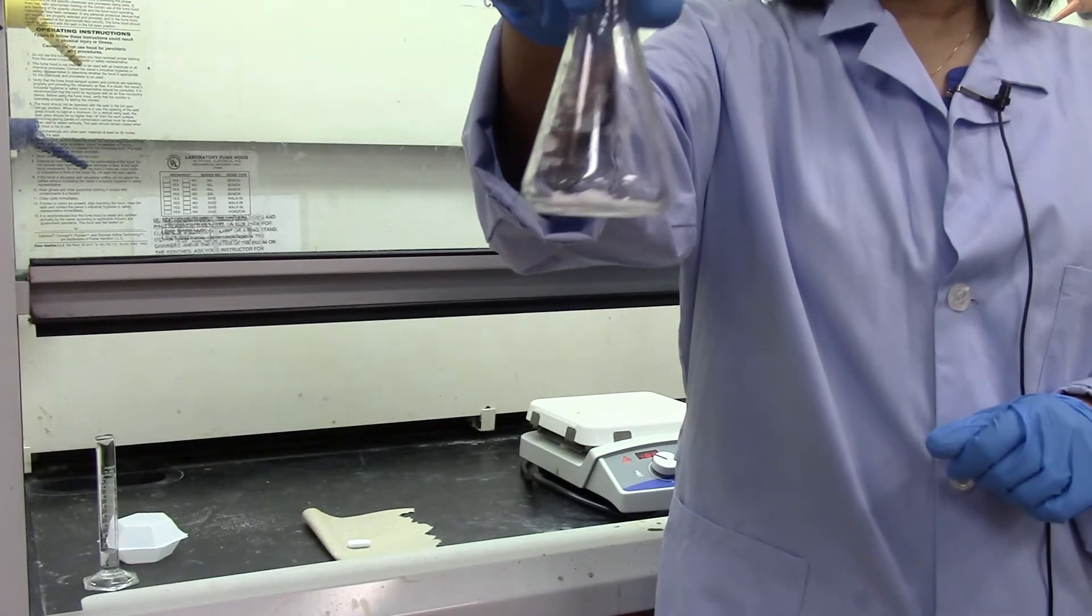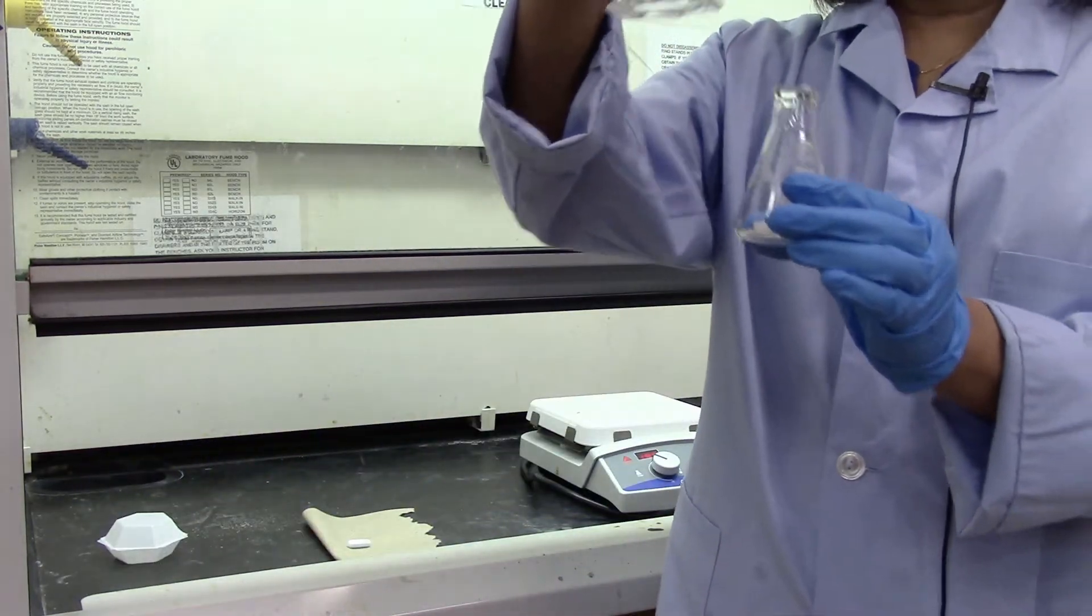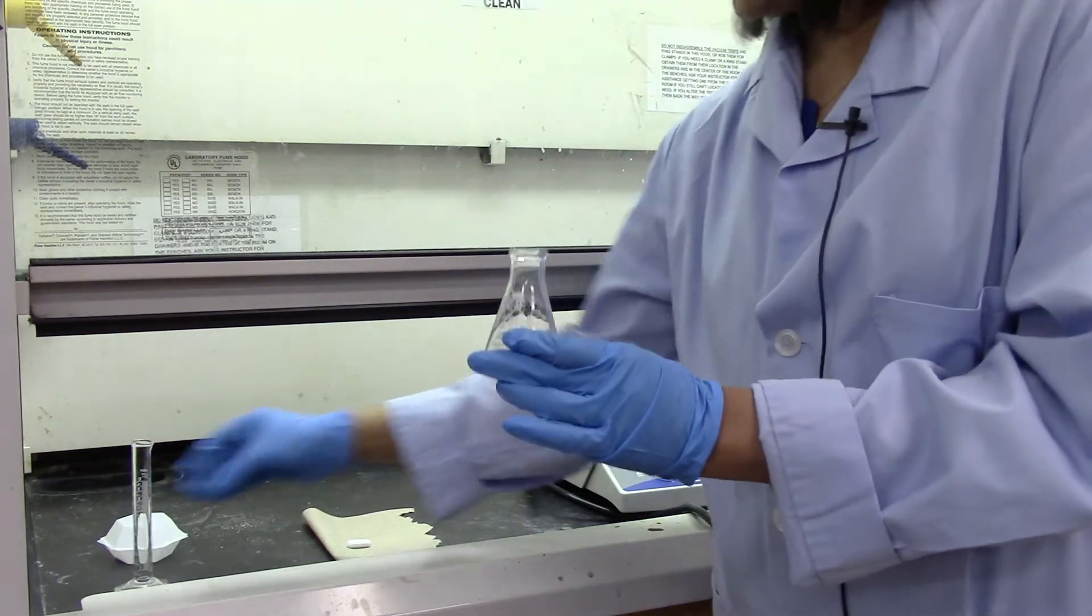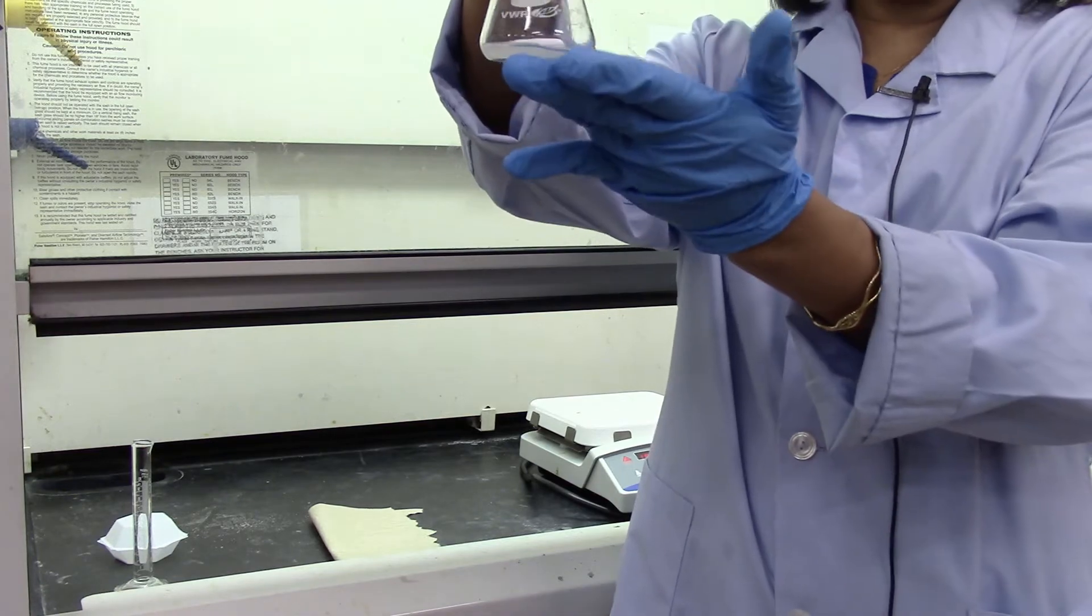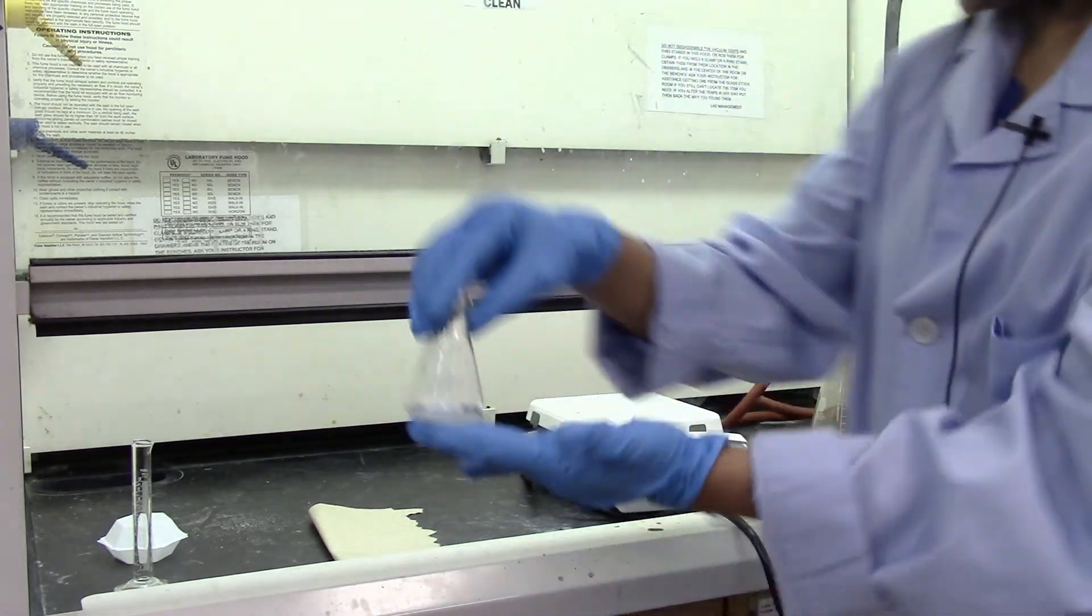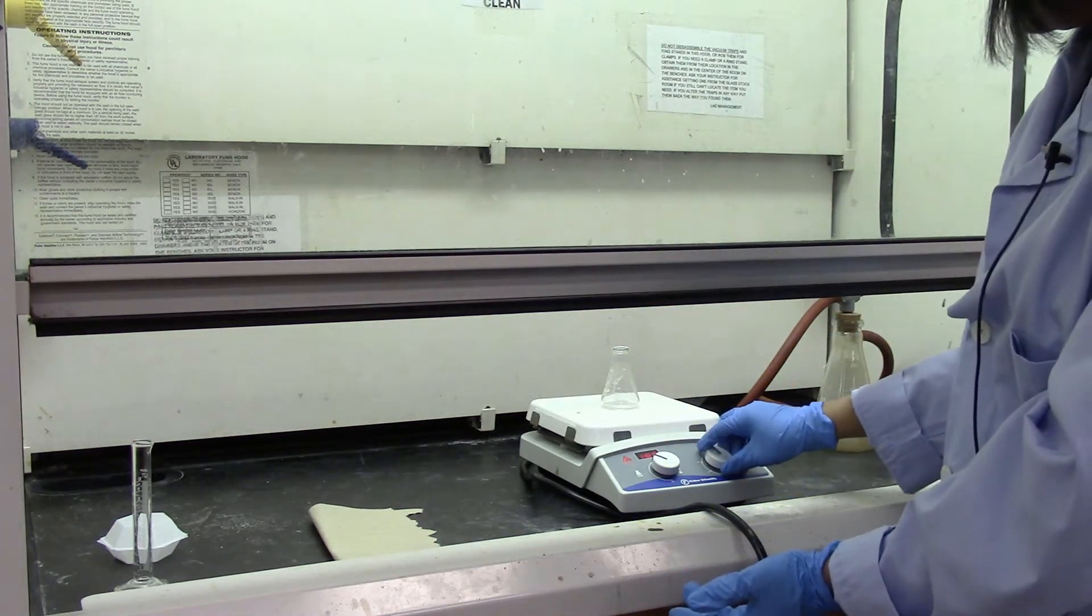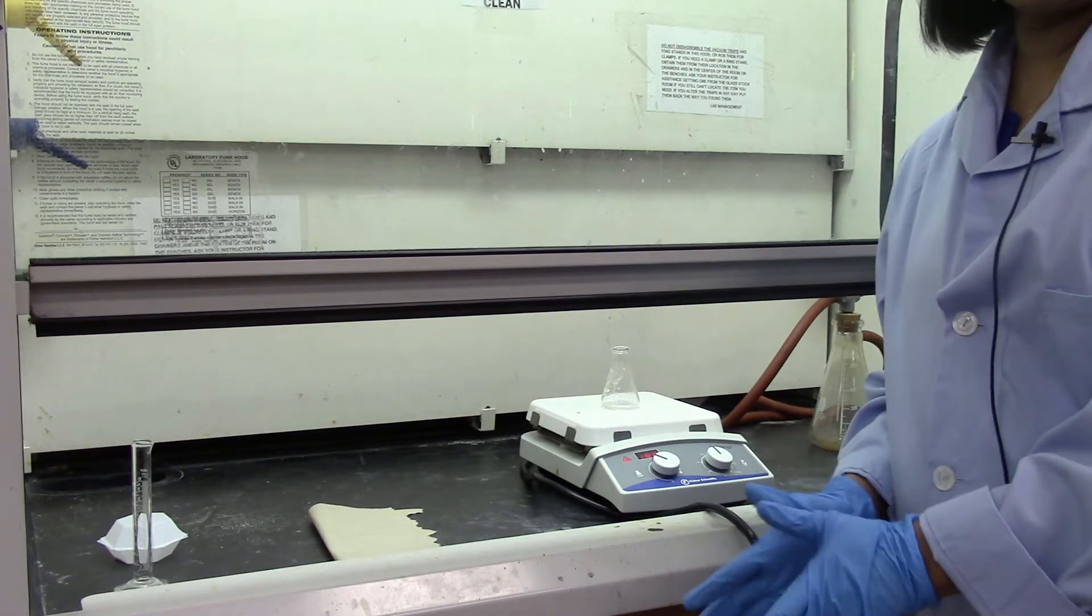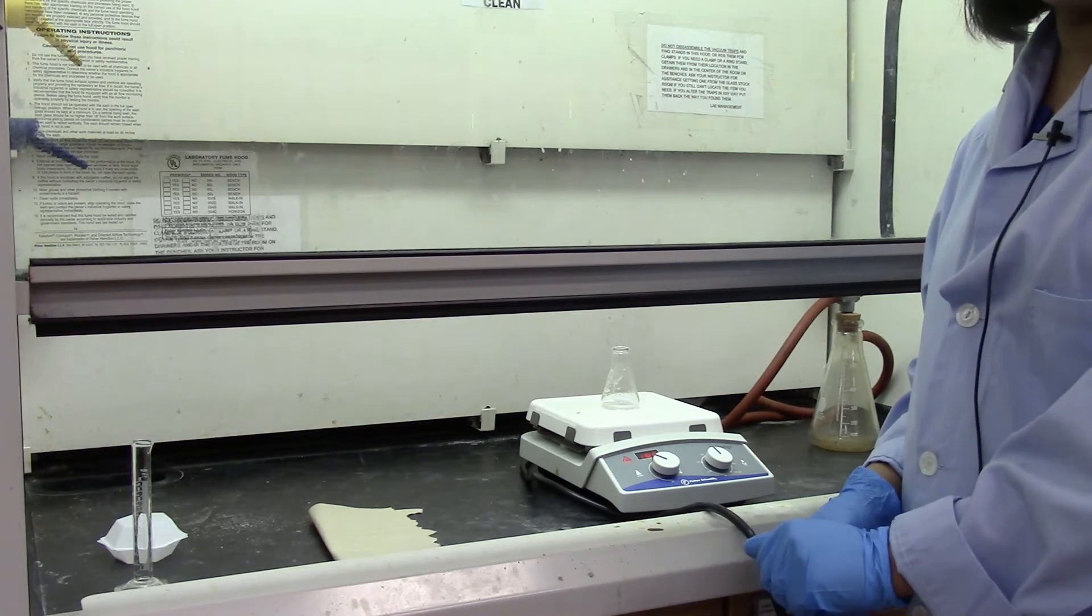I have my 0.3 grams of camphor here and I'm going to add about 2 ml of methanol and I'm going to add a stir bar into this 50 ml Erlenmeyer flask and then I'm going to put it to stir. I will give it some time to dissolve and then we are going to add our sodium borohydride.